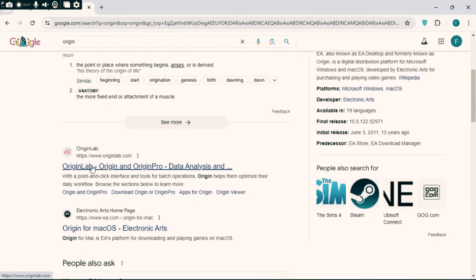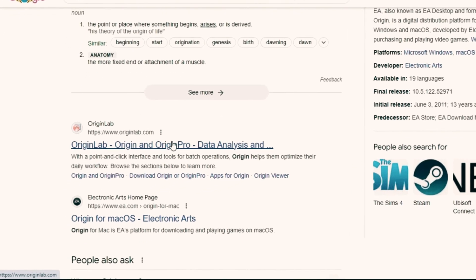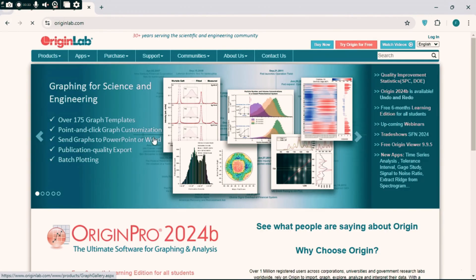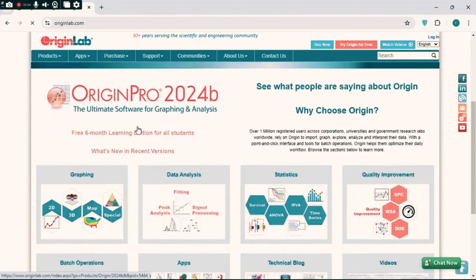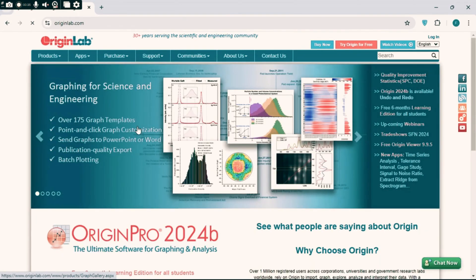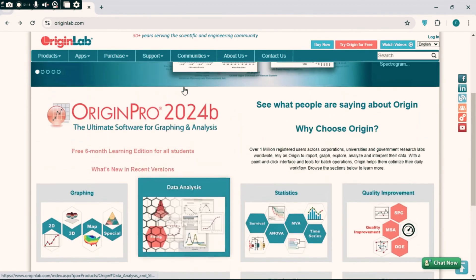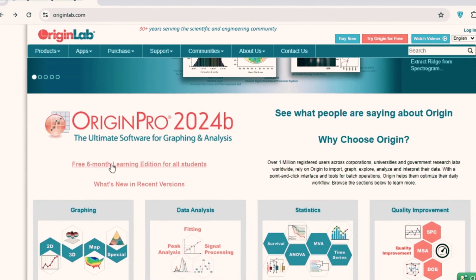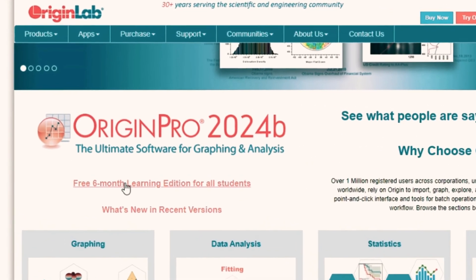Click on the site and here you can see the interface. If you are a research student, you will get a free license for 6 months. And after completing this time limit, you can further apply for 6 months free license again.